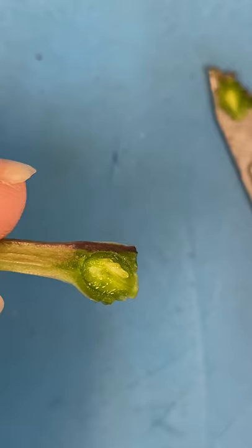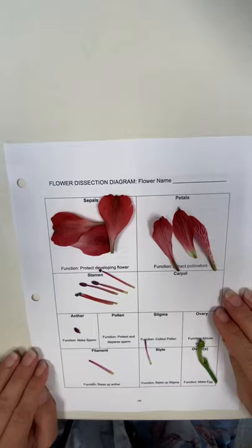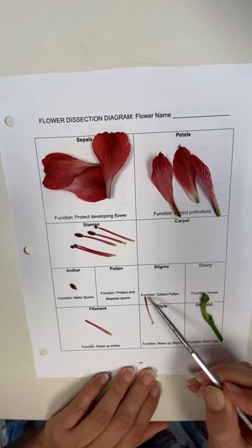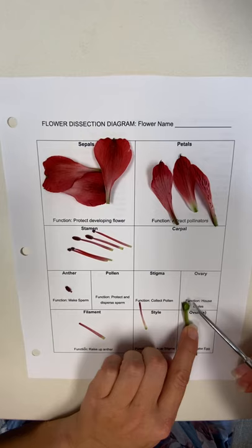We can see those ovules very nicely. Each ovule contains eggs and each one is capable of forming its own seed. So now I'm going to show you our final layout: we have our sepals next to our petals, we have most of our stamen — though I did dissect one anther from one filament. Over here most of this is the style, but the tip is the stigma. And the whole round thing is the ovary, but those individual dots were the ovules. Hopefully you enjoyed this dissection of a flower and understand the anatomy just a little bit better. Have a great day!